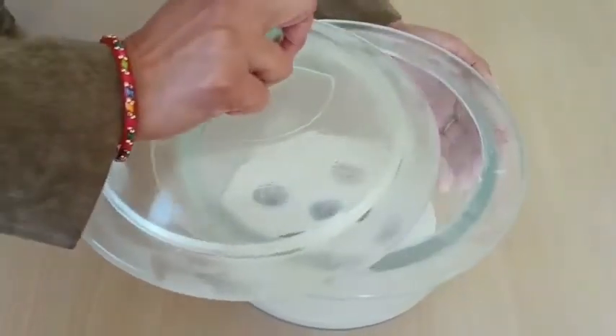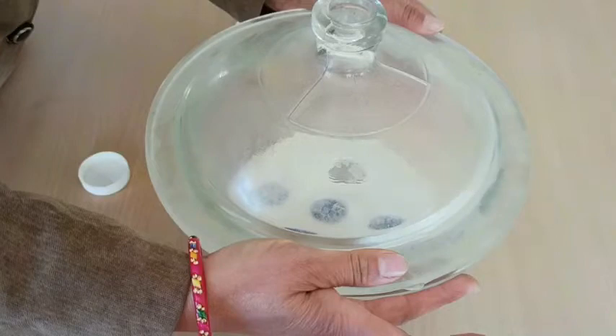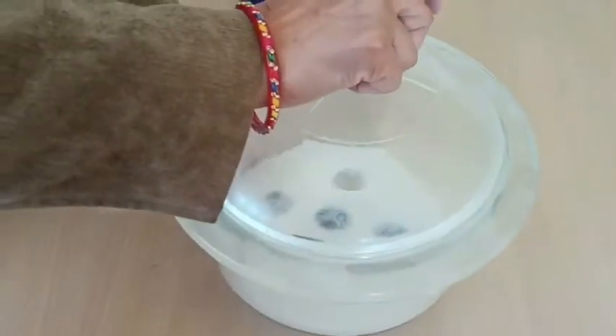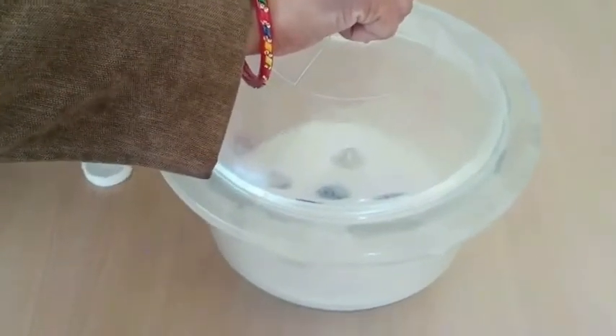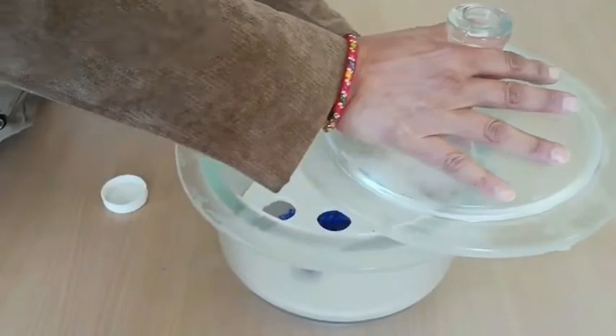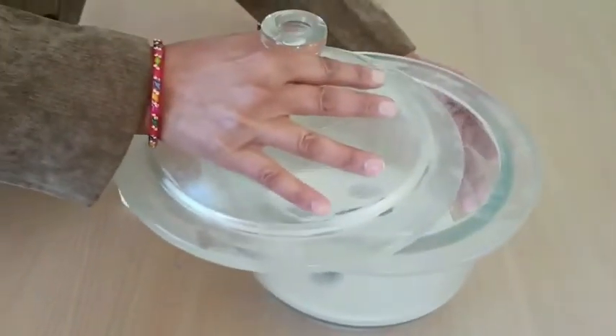To close the desiccator, you have to drag the lid over it. Here you can see how tightly it seals. And if you want to open it, you have to open the lid by dragging it in this manner.